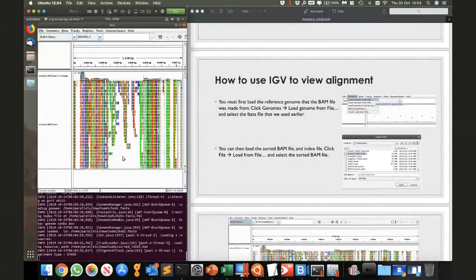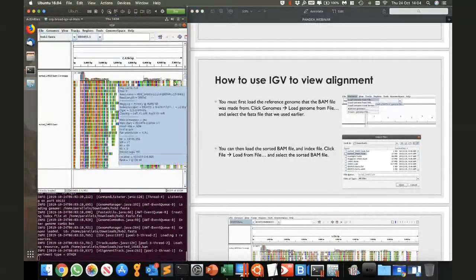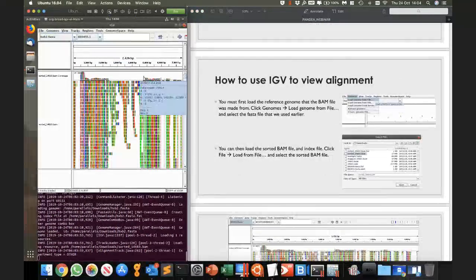Some of the PANGEA sequences were only partial genomes. So when you actually build the BAM files, you might get a lot which cover pol, you might get a lot which cover gag, you might get a lot which don't have any envelope. When you build the files, you'll see this. This is why we view the BAM files, to see what we're working with.